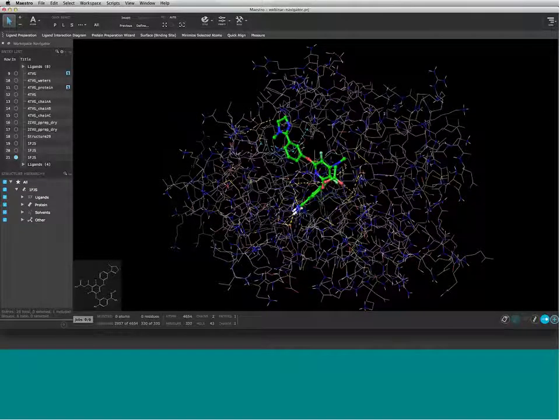Okay, I hope you can all see my Maestro. I'm going to be talking about advanced selection techniques because, of course, selection is very important in Maestro 11.